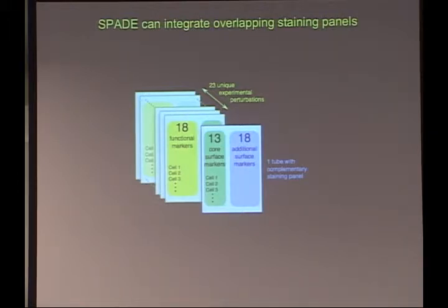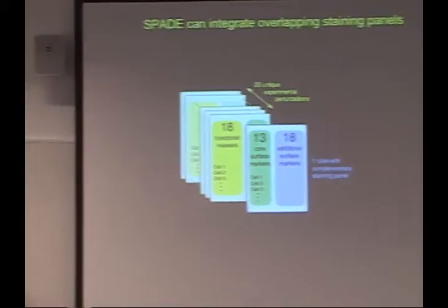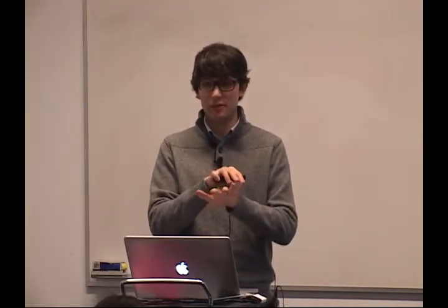Yeah? So, we feed mass cytometry data to SPADE to create these trees, and say that we also have data from an LSR experiment, traditional flow. Can we also feed that data to overlap? I wouldn't really recommend trying to overlap those. You could try it. You would have to individually go through parameter by parameter and make sure that the scaling of the parameters is very, very similar and that you see the same distribution of expression with the two platforms. But that would be key.